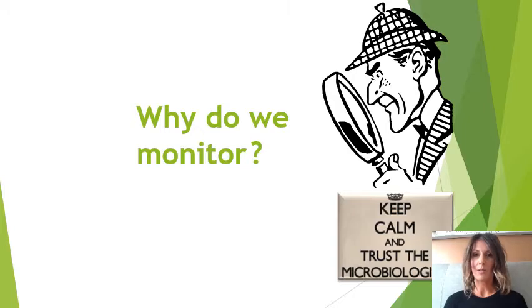Examples of this can be things like dust or soil from outside. We also have chemical contamination, and that can come from things such as cleaning agents, so the residue from cleaning, or spillages from other products, piercing vials from aerosols, and aerosols from cleaning fluid also. And obviously what this section is about, microbial contamination, so the viable organisms that can proliferate.